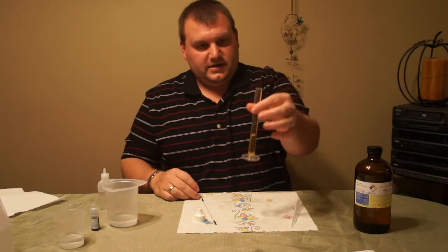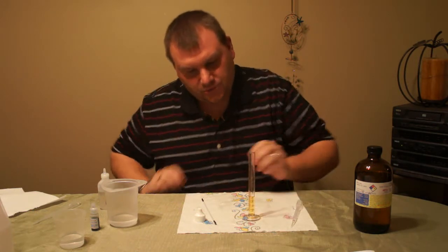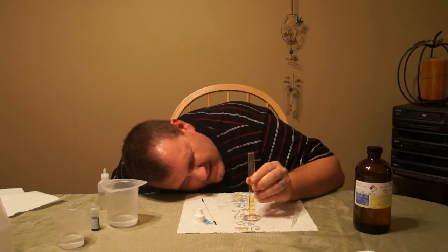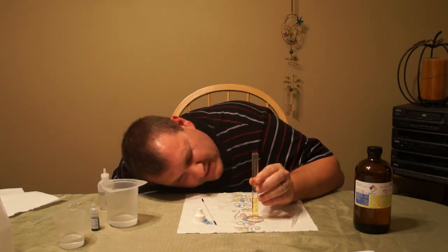So now I have the graduated cylinder and I want to read what the final volume is. It is 4.2.